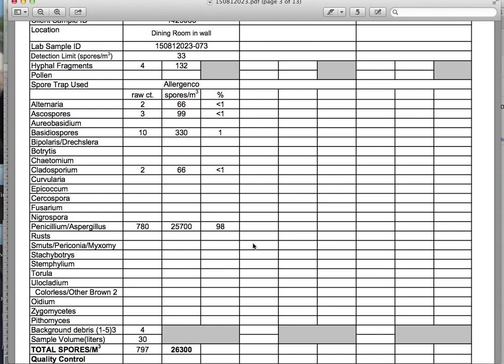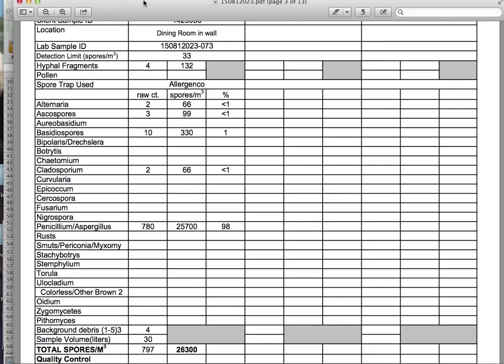If you take a swab sample and it comes back with light Cladosporium, that is likely a surface mold that can be wiped away. If the swab sample is Penicillium aspergillus, that is most likely an issue caused by a widespread problem that has now infiltrated the drywall, so it needs to be removed. Stachybotrys 100% needs to be removed.